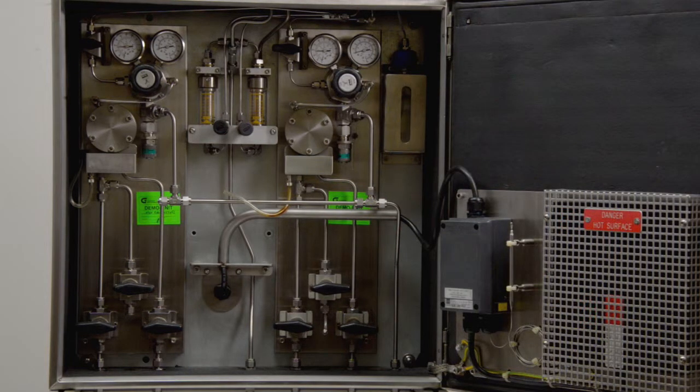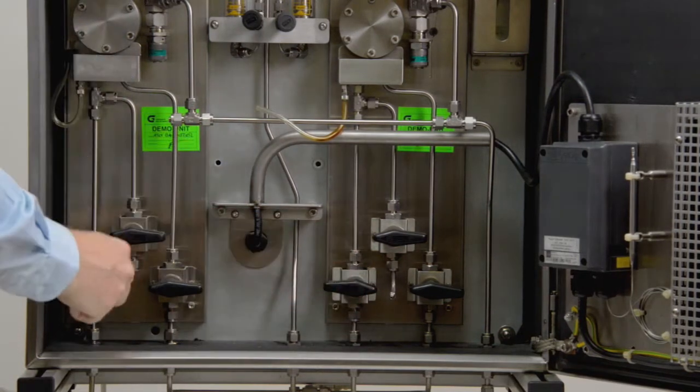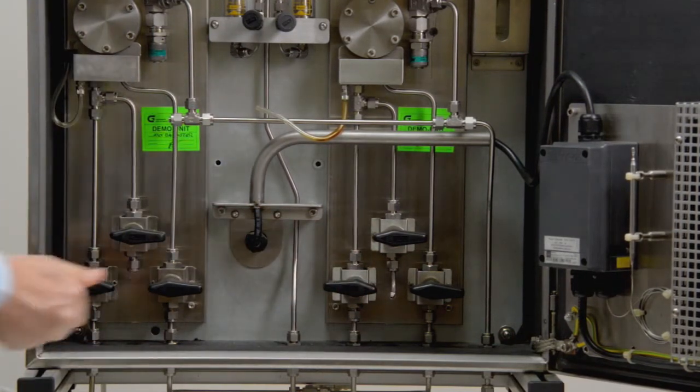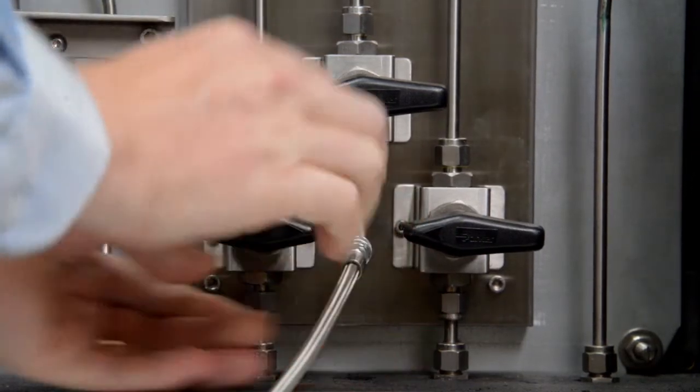A pressurized cleaning fluid can be attached to the fast sample loop. Close the stream valve, attach the tubing of the cleaning fluid and open the cleaning valve.